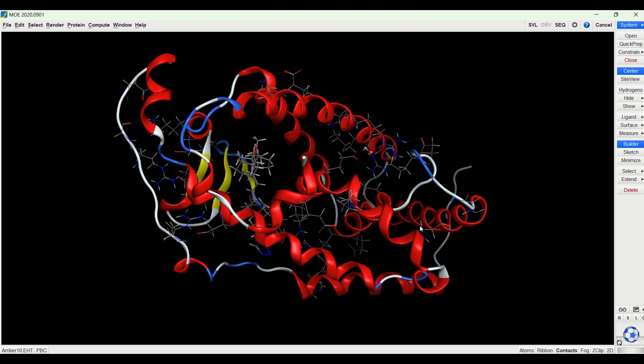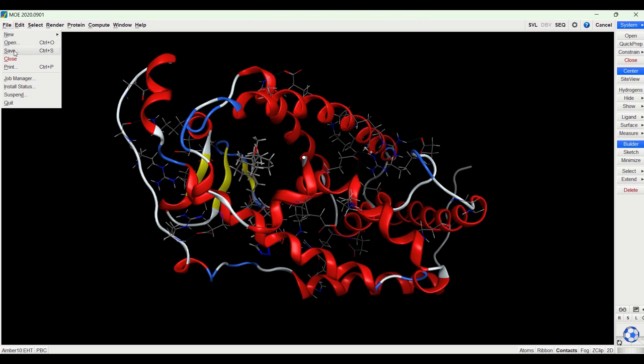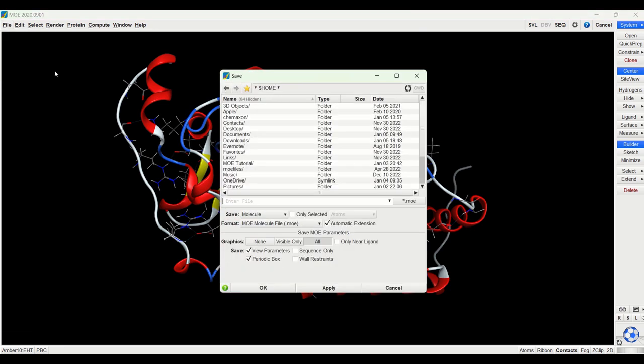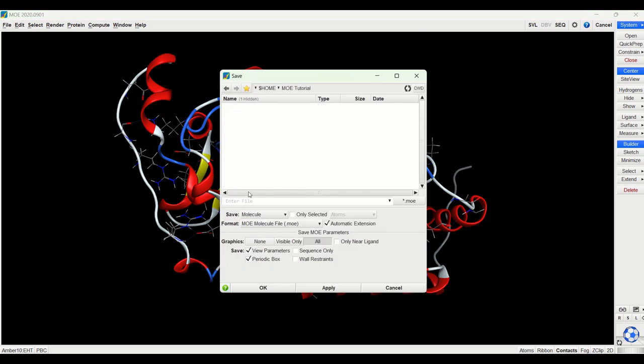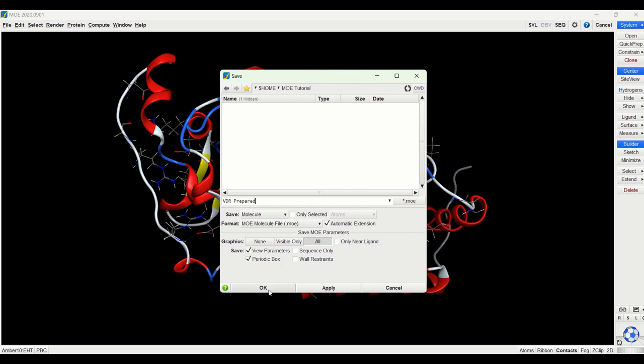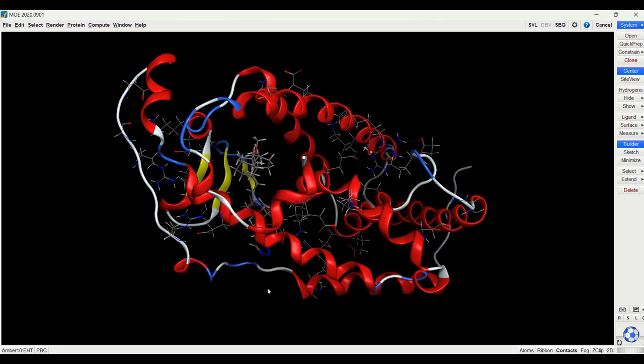So we would now want to save this prepared protein so that we can use the prepared version of the protein for any docking that we would do. So we then go to file, save, save it wherever you need to save your proteins, and enter the file name. I'm going to call this VDR for vitamin D receptor and call it prepared. So now that it's saved, so whenever I do docking with proteins, I would use this prepared version so it's all ready to go.